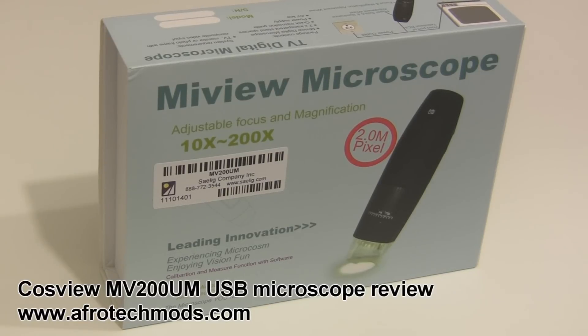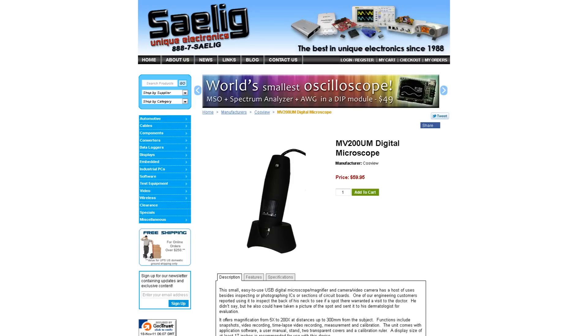Welcome to my review of the CozView MV200UM USB Microscope. The review sample was provided by saelig.com and it sells for just under $60.